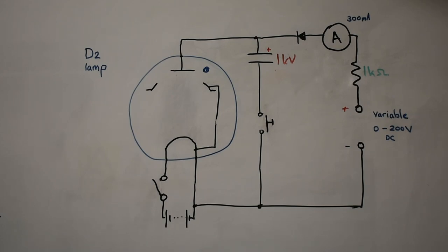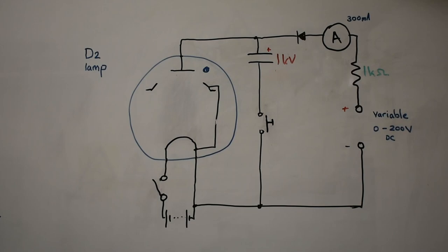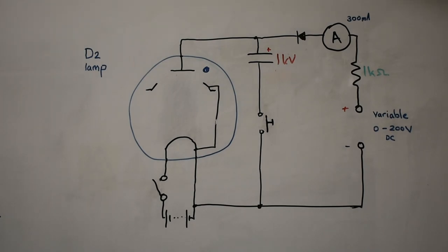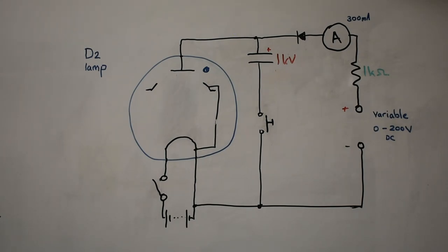We have a heated cathode here running on a low voltage supply and a slightly higher voltage supply here for the plate voltage which is variable between 0 and 200 volts. It generally runs around about 100 volts and we need a starting voltage as well to initiate the arc, which is normally about 800 volts but we've got a capacitor start here.